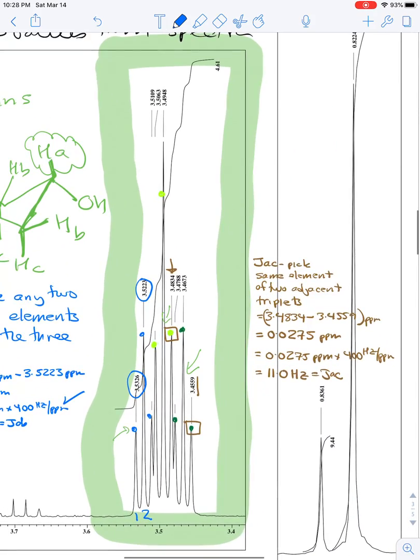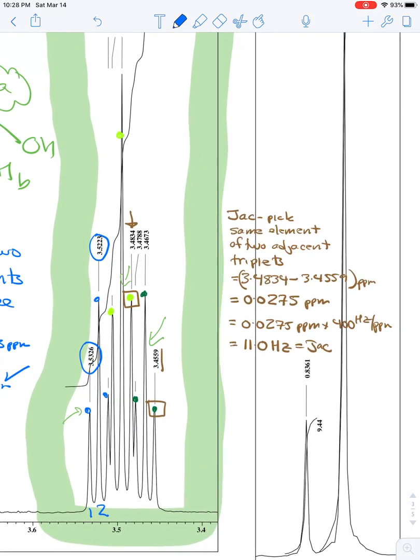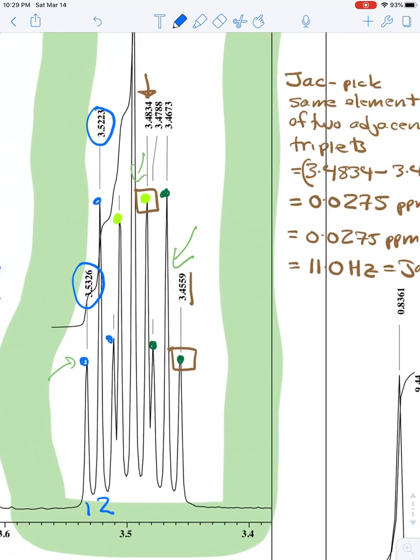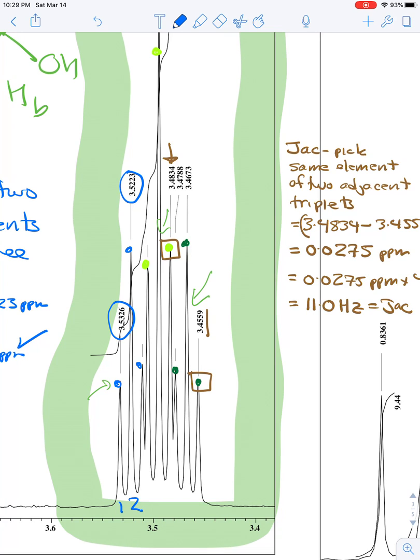So now we're going to do JAC, which again is the larger of the two couplings. And for this, what you want to do is pick the same element of two adjacent triplets. And it really doesn't matter what you do within that. So you could pick two of the big middle ones, I didn't do that because the value is kind of off the screen and makes it harder to see. So what I did is I picked the far right element of the far right triplet, and then the far right element of the middle triplet.